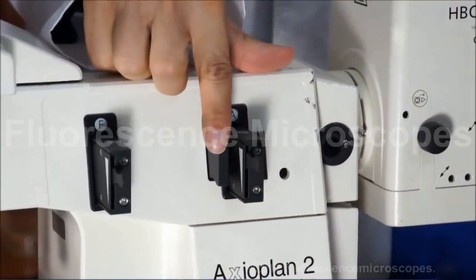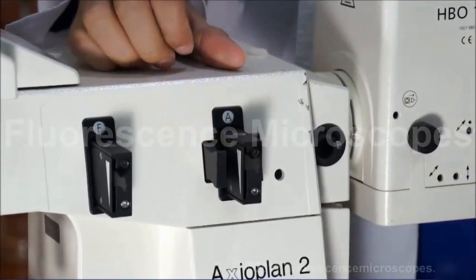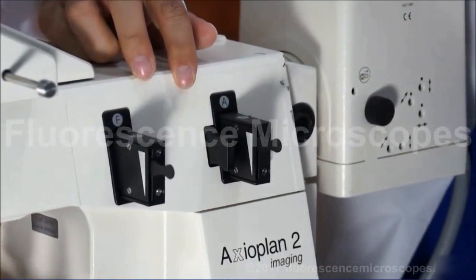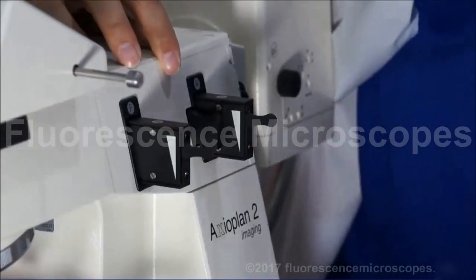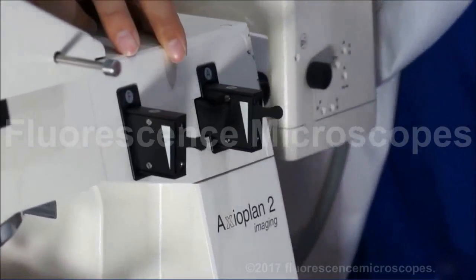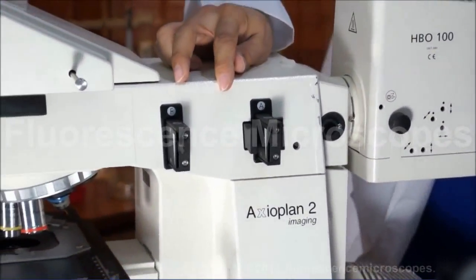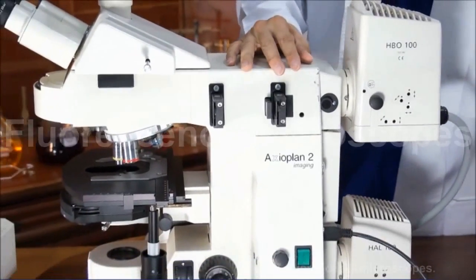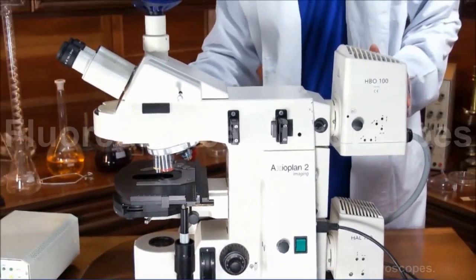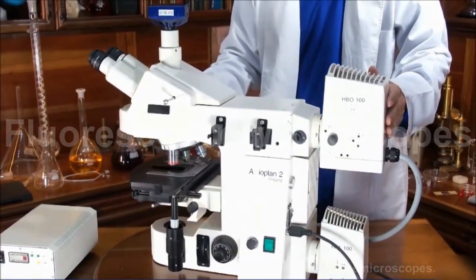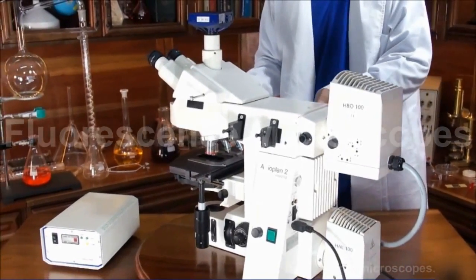And you've also got a filter slider. If you need any other type of configuration, we've got a lot of different components for these, just let us know what you might need.